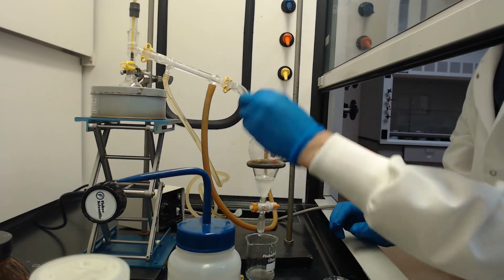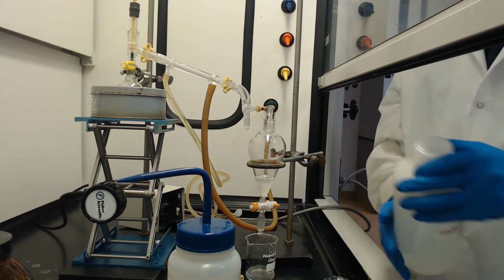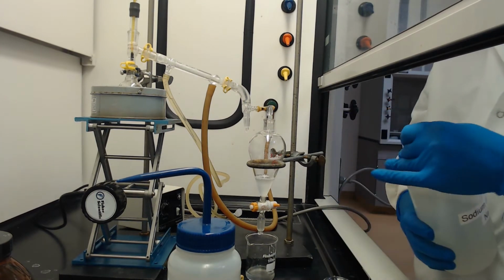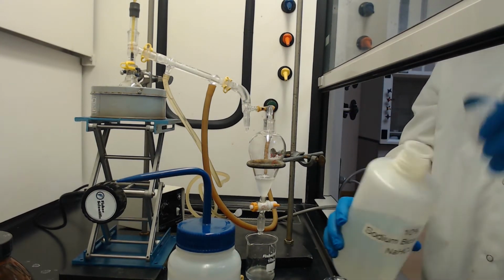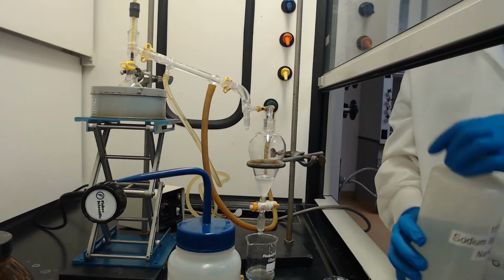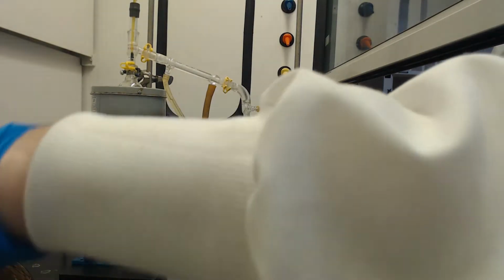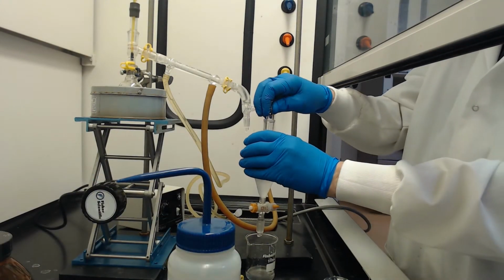I'm going to put this on here because our product is pretty volatile and it'll come out. The next wash, we're going to do 10 mils of bicarb. So I'm just going to pour this here, approximately 10 mils. There it is. Okay, so this is a base, and this is going to generate, we believe, CO2 when it reacts, because this is acidic.